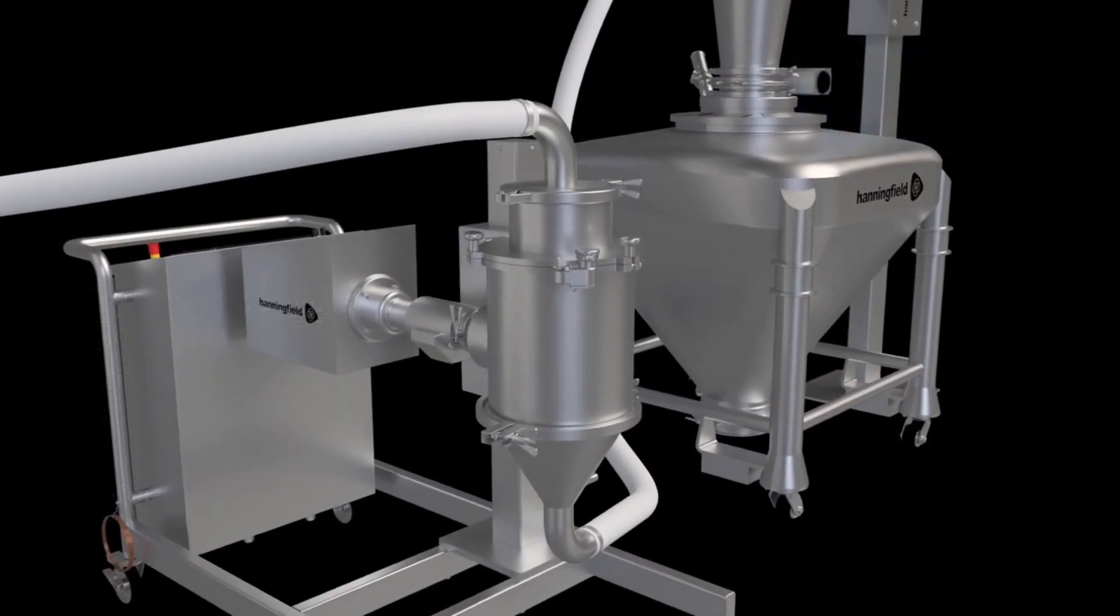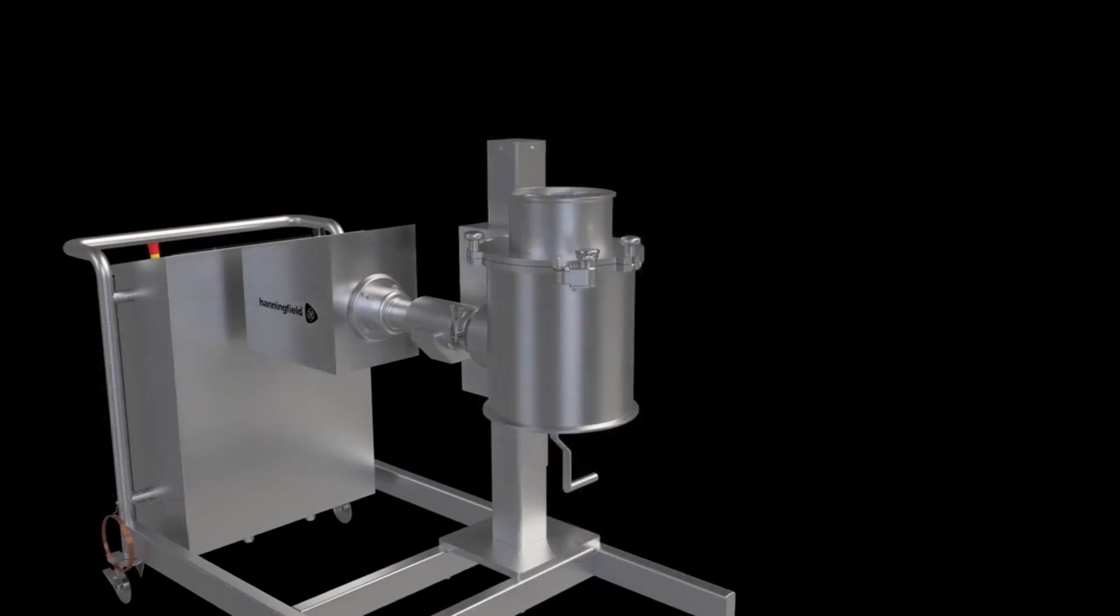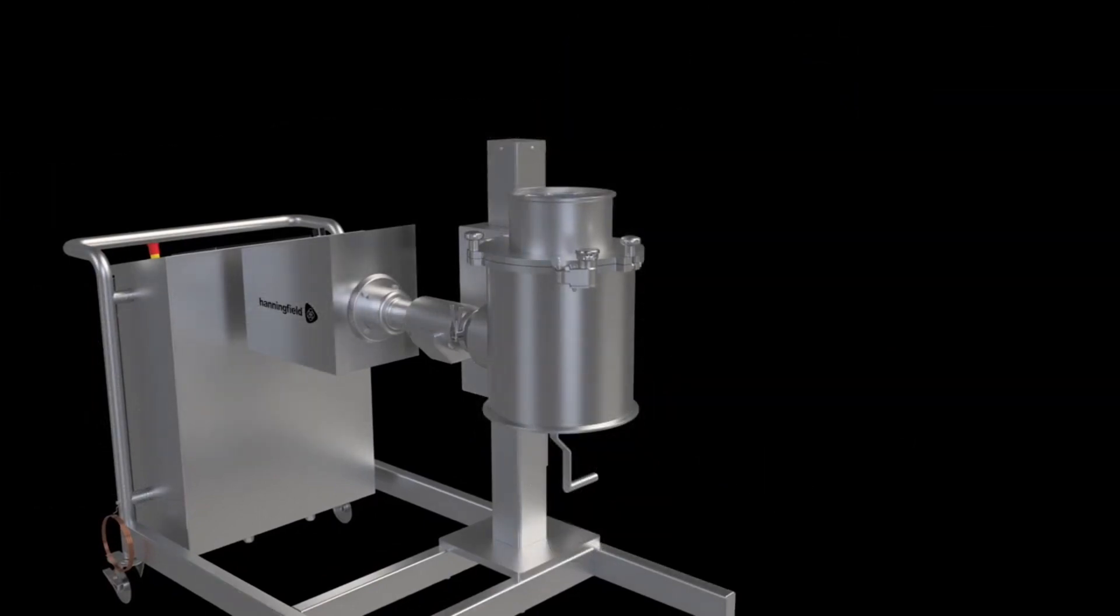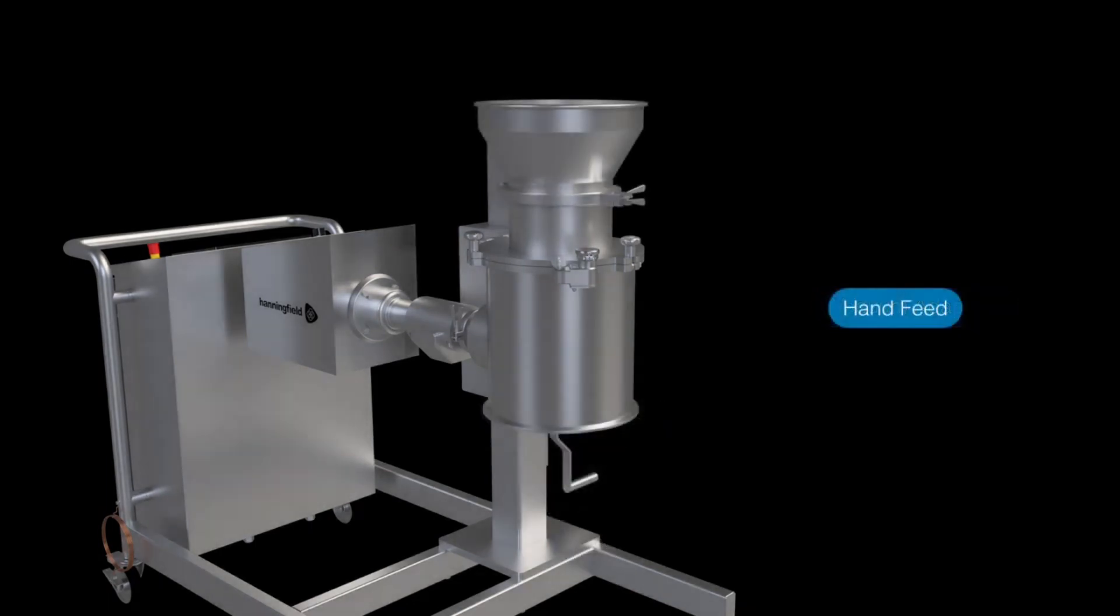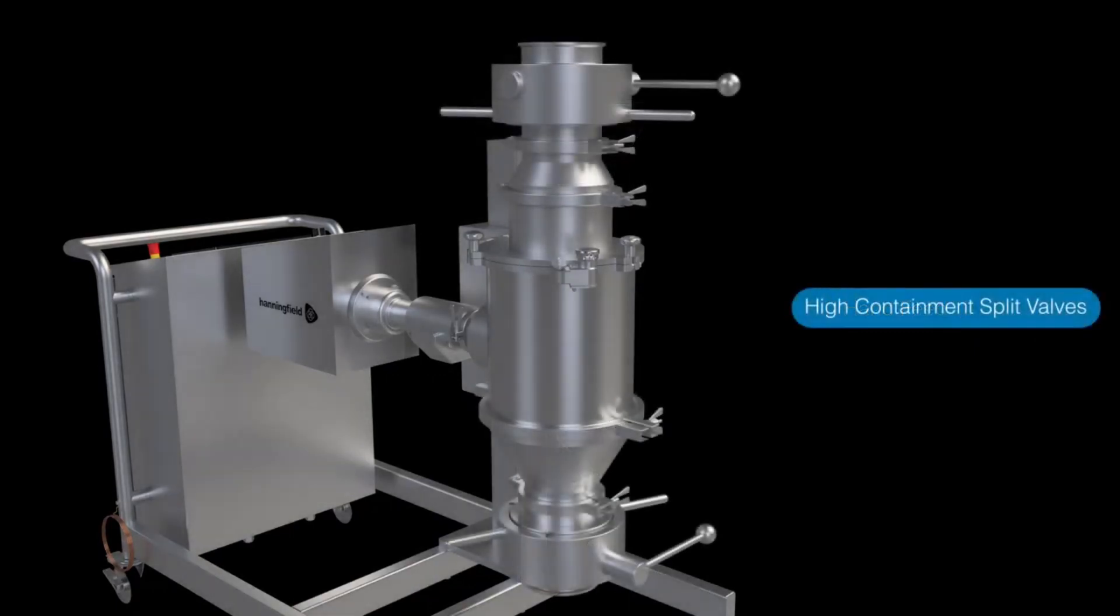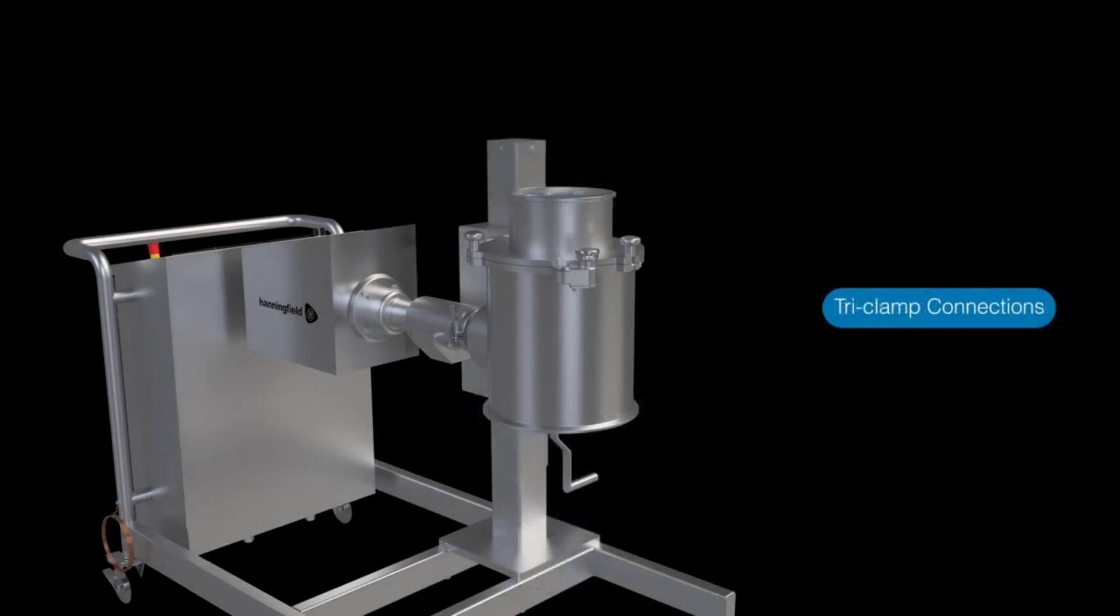The Unimill can be highly customized to meet your demanding process requirements with various frame mount options such as swing arm or portable trolley. The mill can also be supplied with various feed and discharge configurations, including vacuum adapters, hand feed, high containment split valves, and tri-clamp connections for connecting almost anything. The unit can also be made suitable for use in explosion-proof environments up to ATEX zone 20.